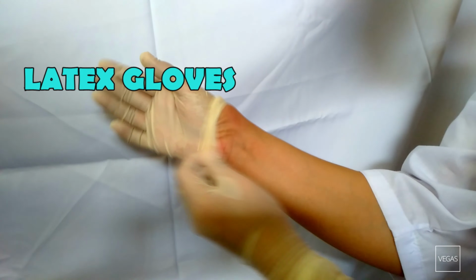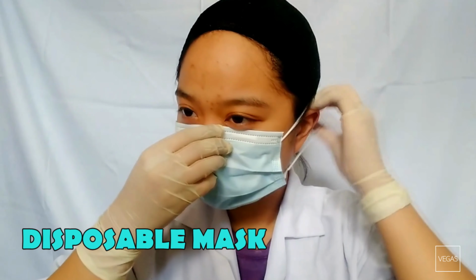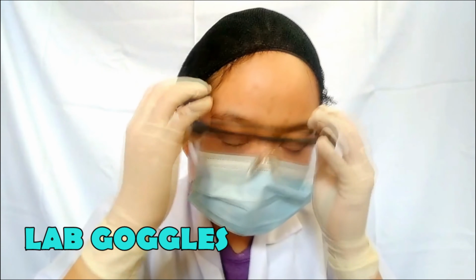Today we'll find out about protein denaturation using this guy by doing 4 experiments. But first, let's check our proper protective equipment. Lab gown, gloves, tie your hair, wear your hairnet. Wear your mask properly. Lab goggles. Now that we're all set, let's go!